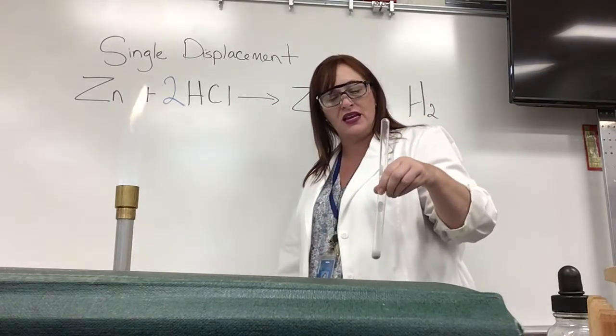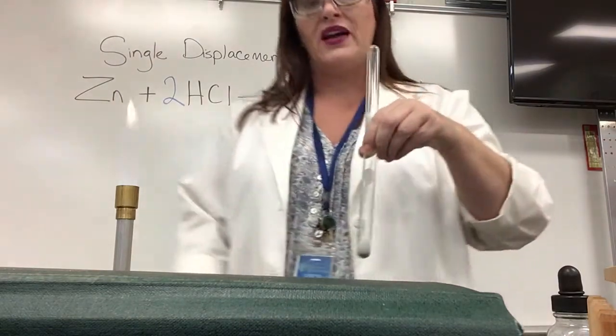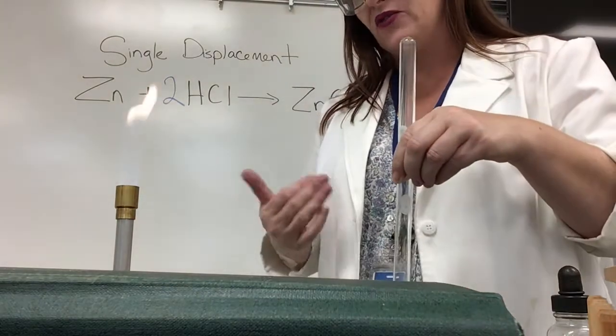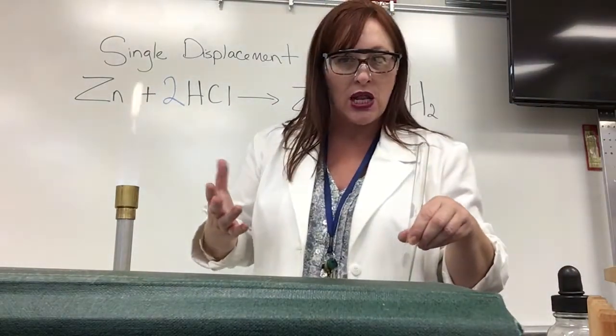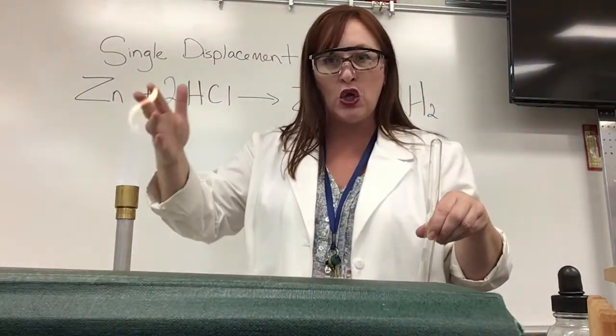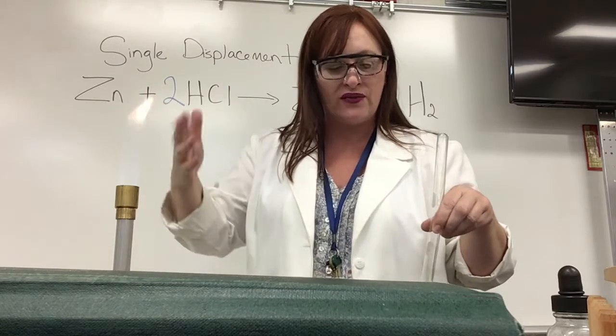All right, let's check and see if I really do have hydrogen gas. One of the neat features of hydrogen gas is that it's flammable. This is why the Hindenburg blew up, because it was full of hydrogen gas.